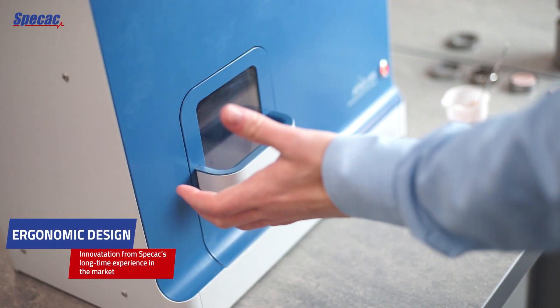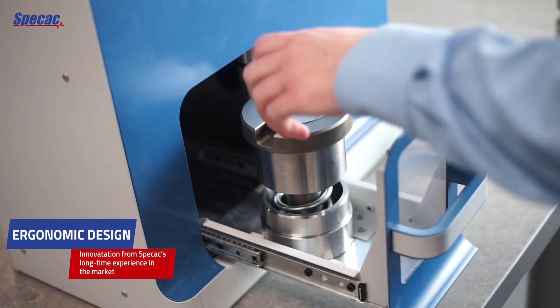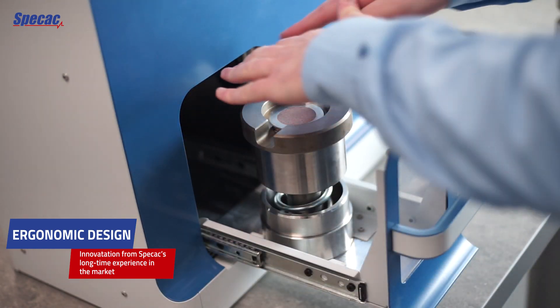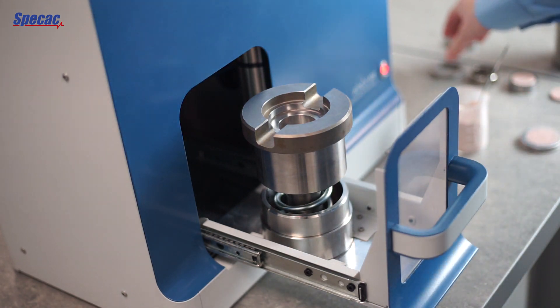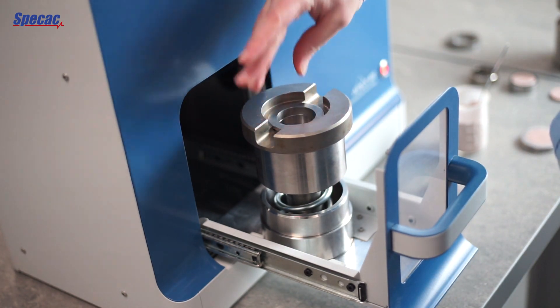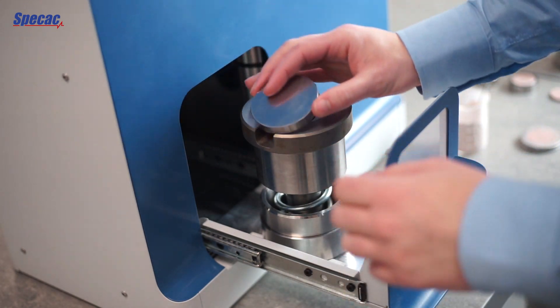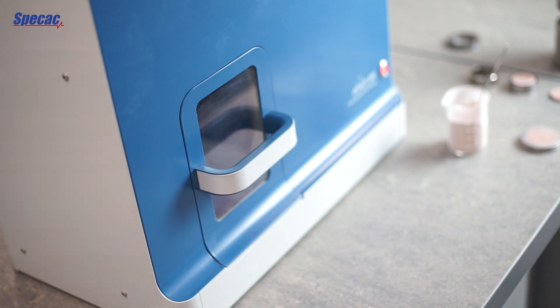Sample loading is via this drawer, which is positioned at a comfortable height at desktop level. As you can see, it's very easy to reach in from either side or over the top, remove your sample, place a ring for the next one, add sample if you have it, press the cap and be ready to go again for the next sample.